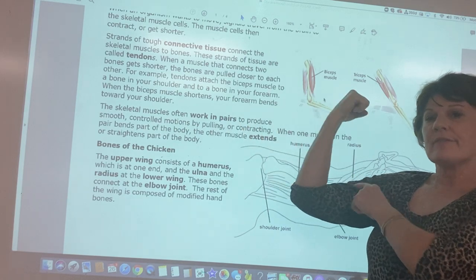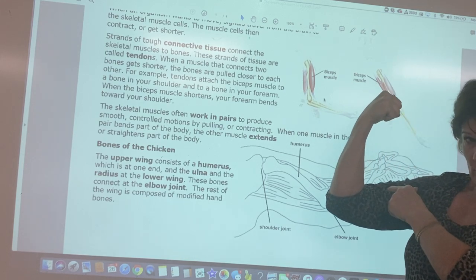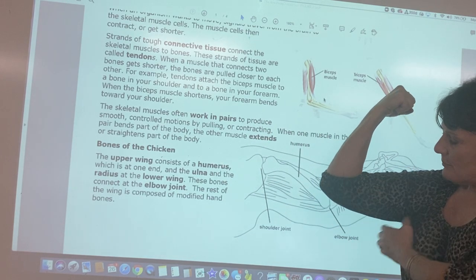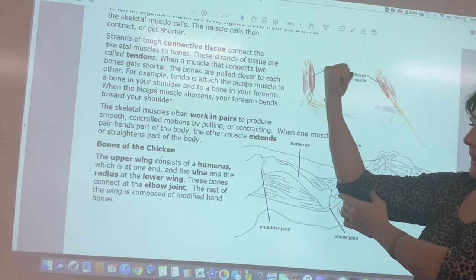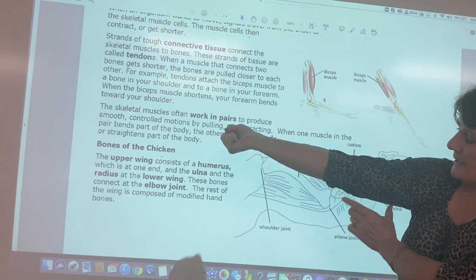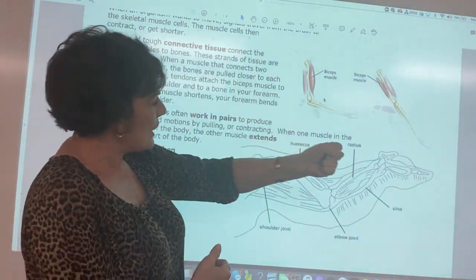In the front we have the bicep muscle. When we lift something, it contracts — gets shorter and fatter but not longer. That contracts the bicep but extends or lengthens the tricep underneath. When we put our arm down, it lengthens the bicep and contracts the tricep.